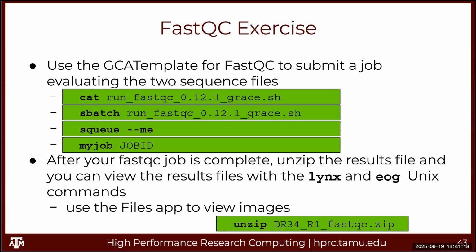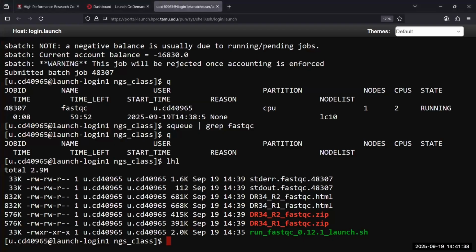This is a FastQC job. It's doing the quality assessment on Illumina reads. It's probably done already. Hit Q again. Q. Enter. See, it's already completed. So you should see these files. Okay, well now there's 2 zip files that just have all the images in there.